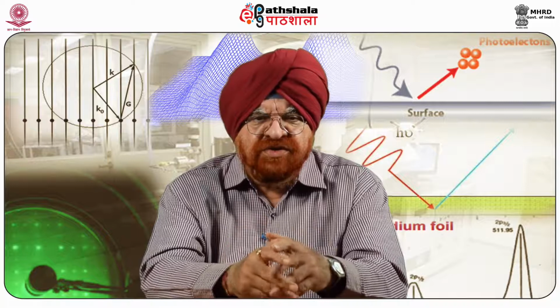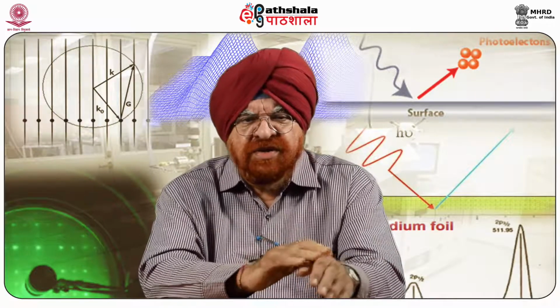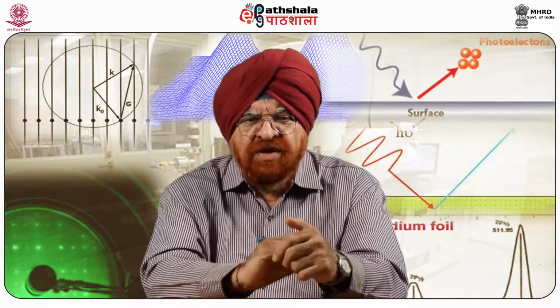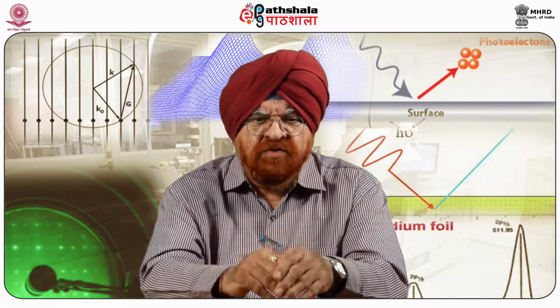AFM and MFM images of the sputter-deposited SiMn 20% film after thermal annealing at 600 degrees centigrade. The AFM scanning was performed in the tapping mode, whereas MFM in the lift mode by means of a cobalt chromium coated tip magnetized just before scanning. The measurements were carried out under room conditions, from a 1.7 micrometer thick film deposited on the crystalline silicon.